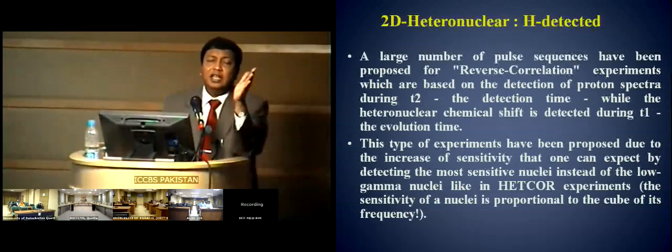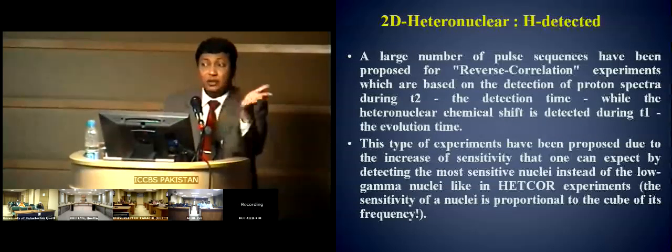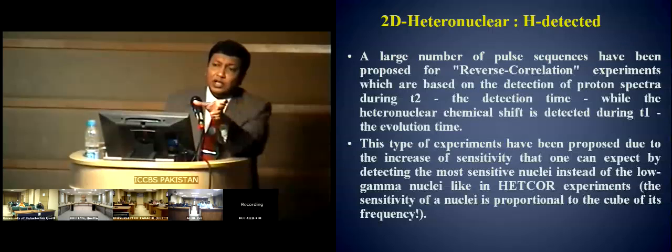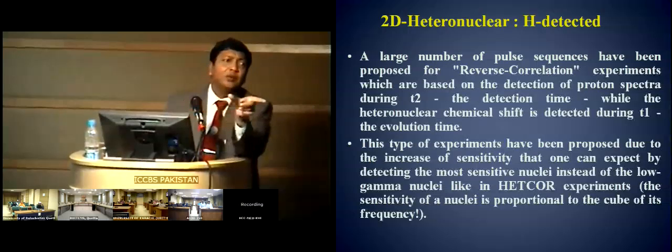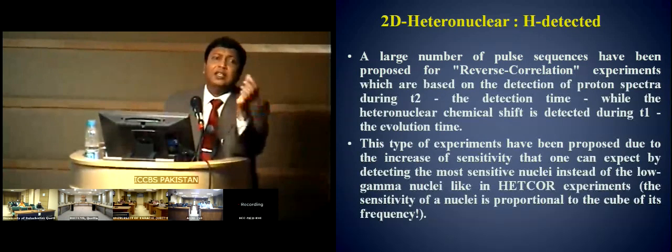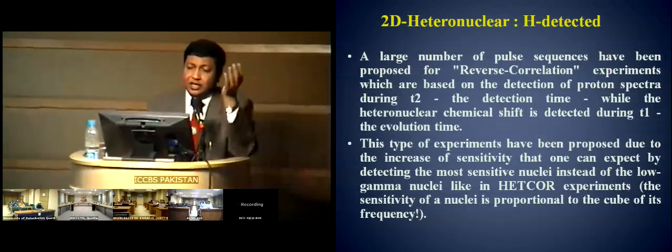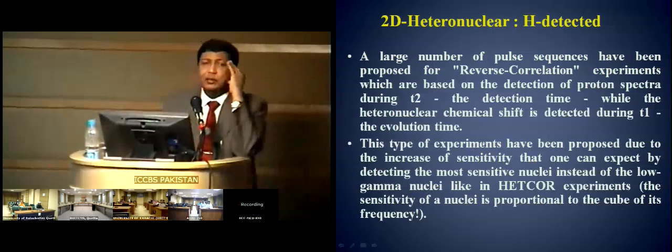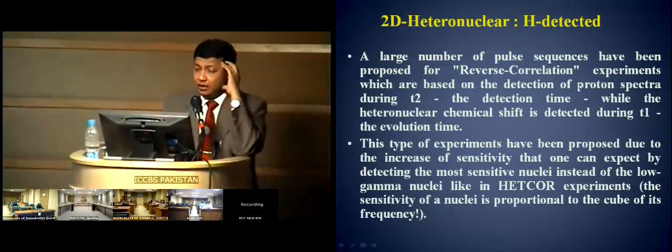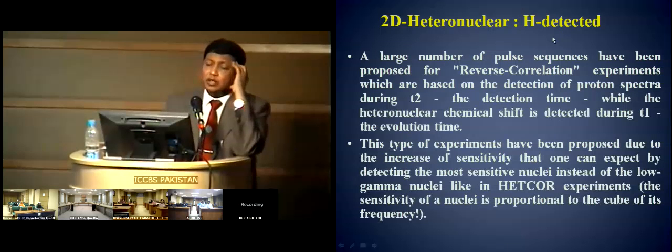Kindly remember that in INEPT you get information about proton which is not detected. In COSY 45, in COSY NMR spectroscopy, the same phenomena, and you have a modulation. When you have a modulation, you know which one is labeled with which one. So when you have a same energy level shared by it, the information transfer takes place. And that is the key of two-dimensional NMR spectroscopy. In this case, this is an inverse experiment. There's a whole set of experiments, lots of them, about 100 or over of them, and they are called inverse experiments, and also H1 detected, proton detected experiments.